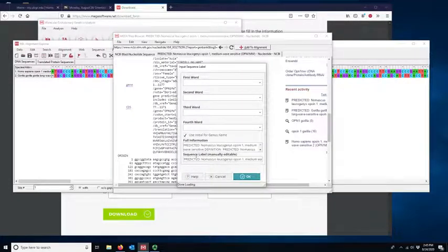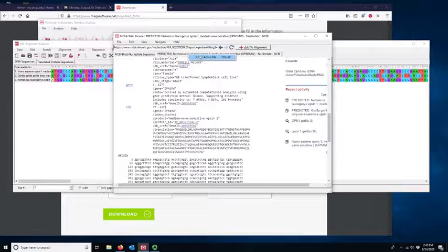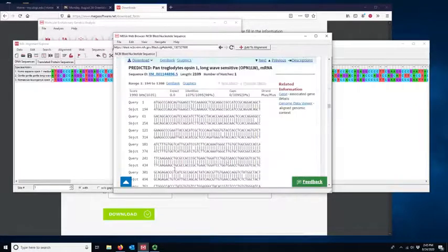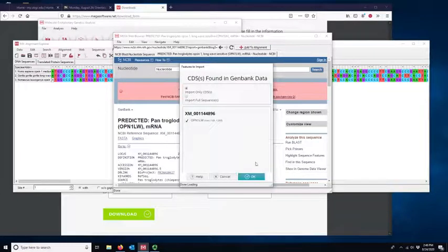Let's do that one. We'll change the name so species is first. I don't know why. I guess I must have not changed it before I hit enter, but okay. There we go. Now let's add that one last one. So I'm going to close this tab, come back to our descriptions, and let's add the chimpanzee. There's our link. Here's our sequence, add it to our alignment.